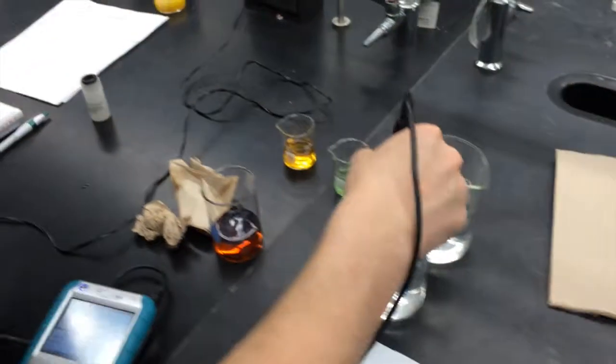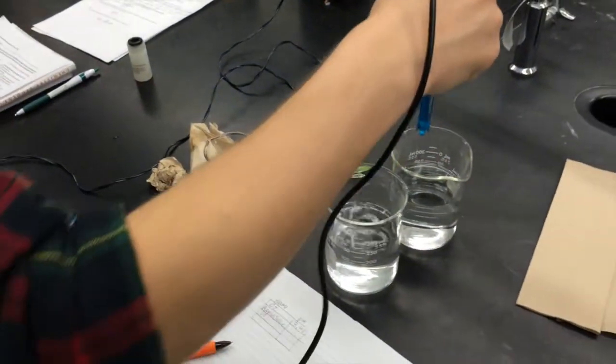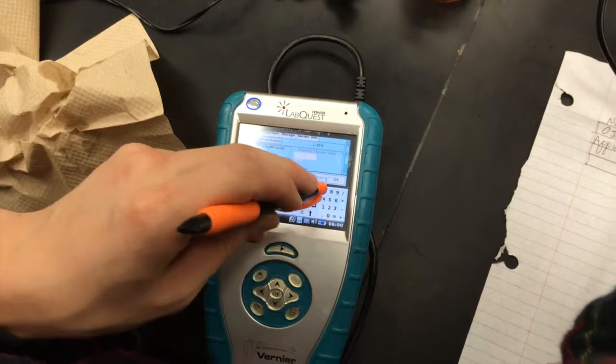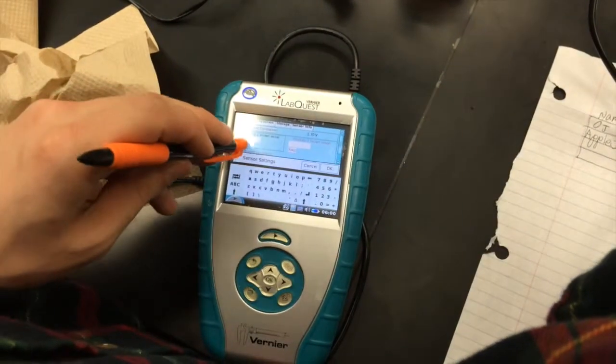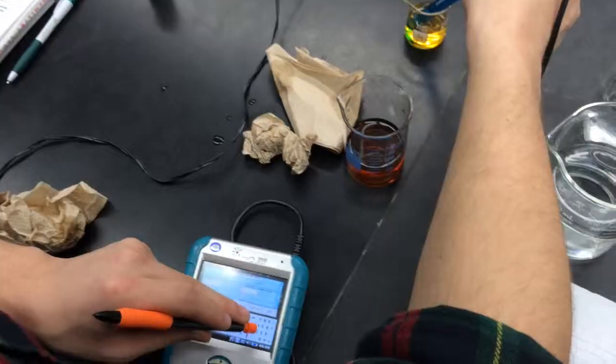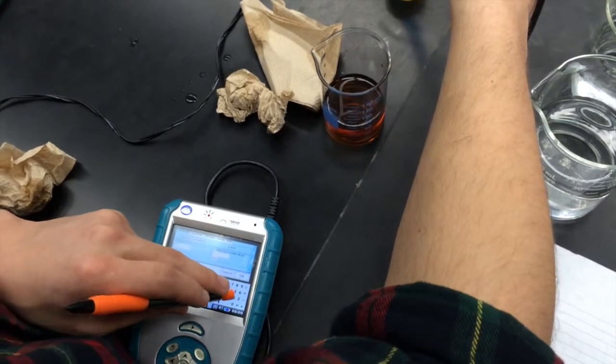Here you can see Stephen preparing the meter to obtain the pHs of the buffer solutions. This will calibrate the meter. Here Stephen calibrates for the 7 pH buffer, and now for the 4 pH buffer.